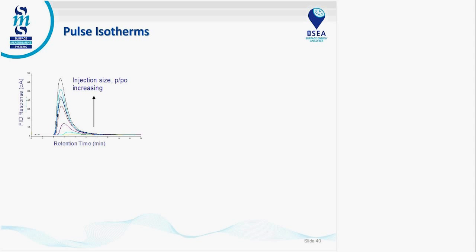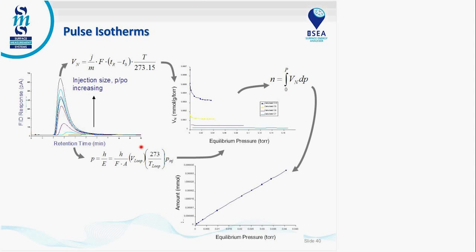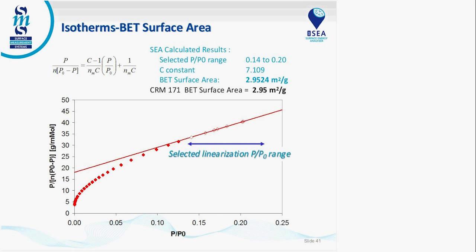Moving on, in the last few minutes of the presentation, I wanted to briefly go over some other properties besides surface energy that can be measured by inverse GC. One of those is an isotherm. You do several different injections of different concentrations, and from that you can generate an isotherm. This allows you to determine Henry's constants, and also things like BET surface areas. I would never say that an inverse GC would replace a nitrogen or volumetric BET surface area instrument, but you can get accurate results.